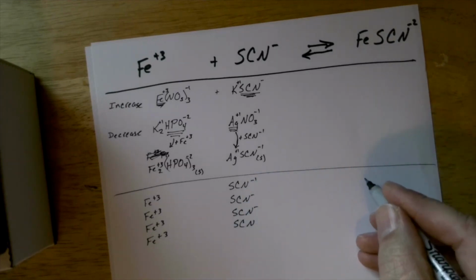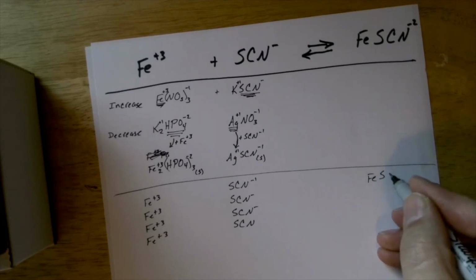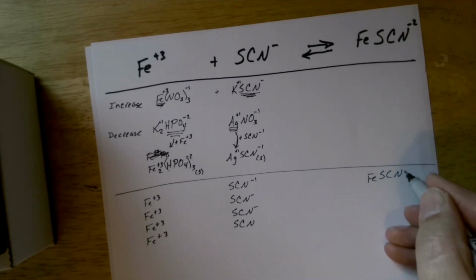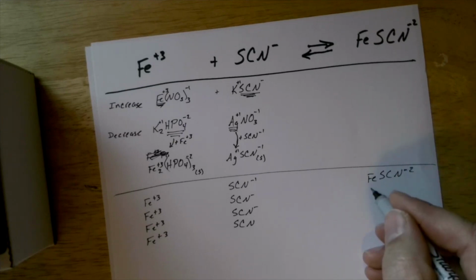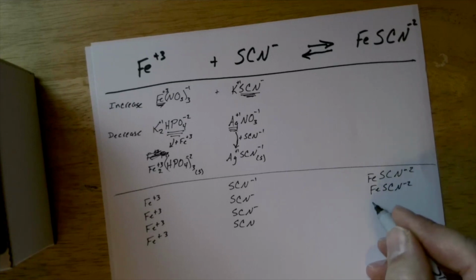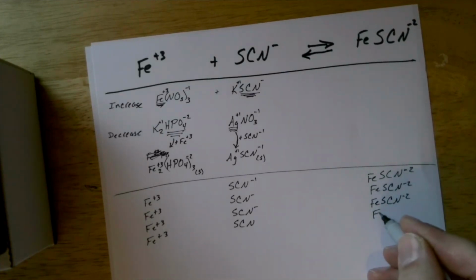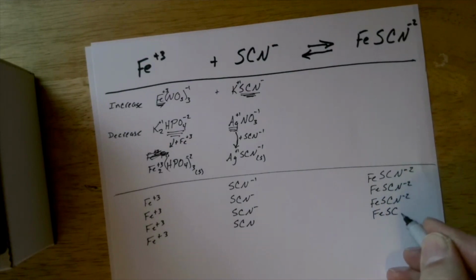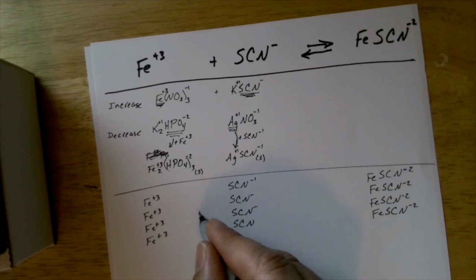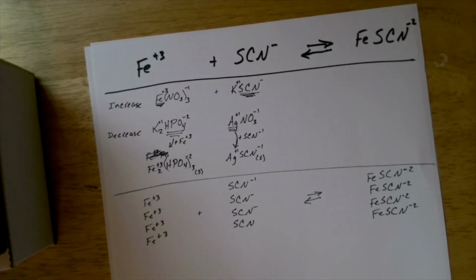And also making the iron 3 thiocyanate. Okay. So again, this is in equilibrium.